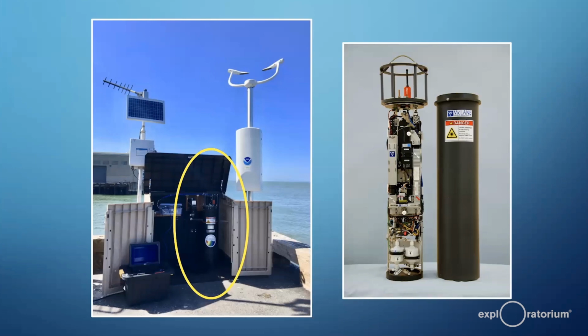So what we're looking at is my coworker, a robot named Miranda. On the right is a picture of Miranda outside of her ocean and weatherproof protective housing. The housing is on the far right, and the tower of electronics is Miranda. And on the left is a picture of Miranda's house at the end of Pier 17, right next to the Exploratorium. So what Miranda is, she's called an imaging flow cytobot, an IFCB, and she is an autonomous underwater microscope. We don't operate her underwater, but she could be.